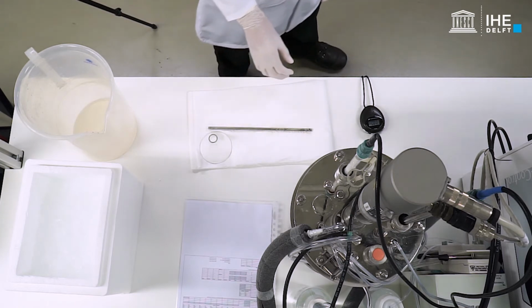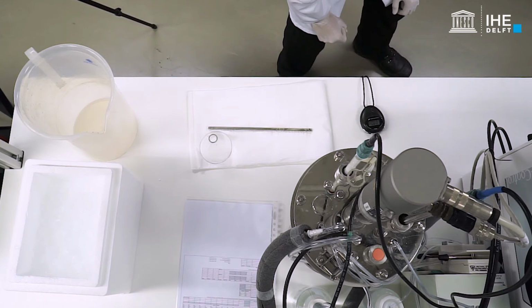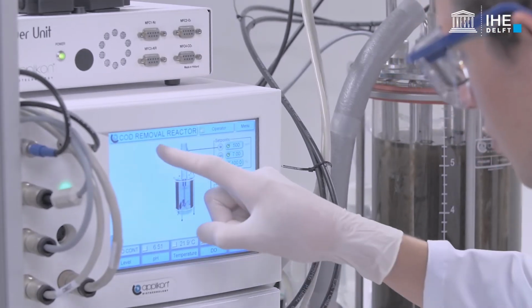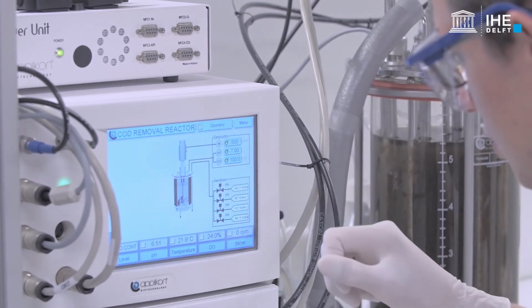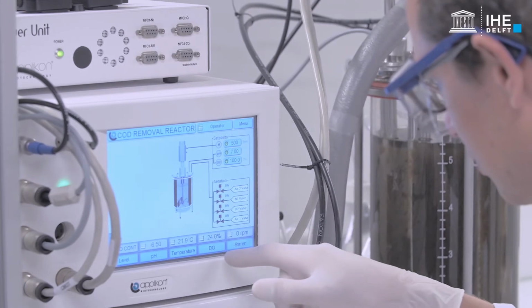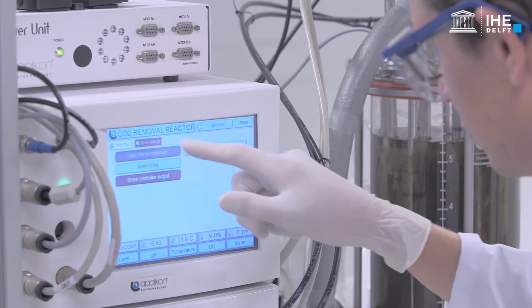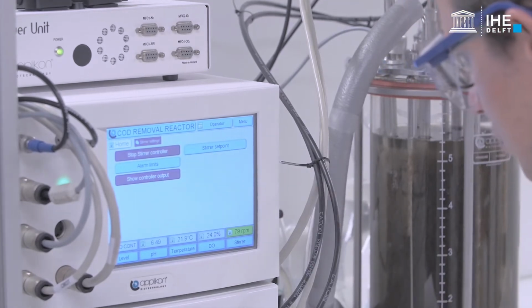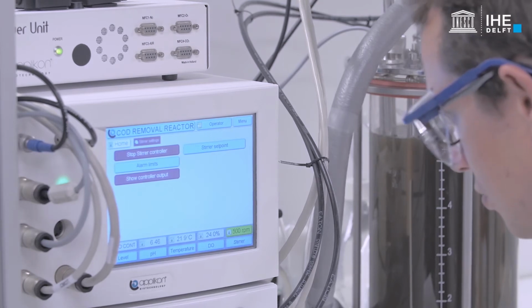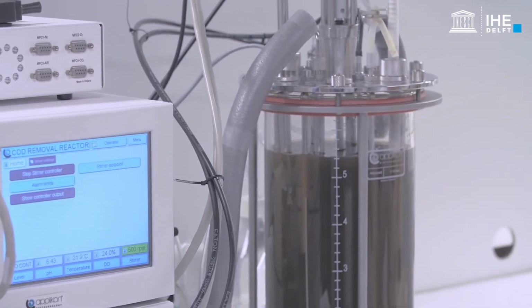Once the sludge has been poured, close the reactor and start up the stirrer. Verify that the speed is adequate to keep the sludge sample well mixed.